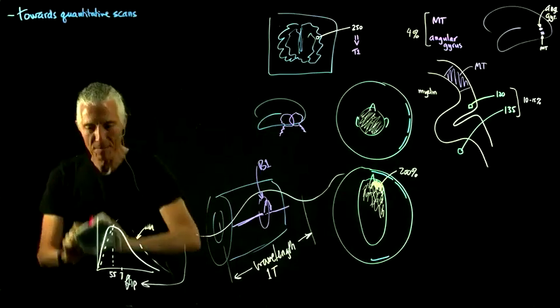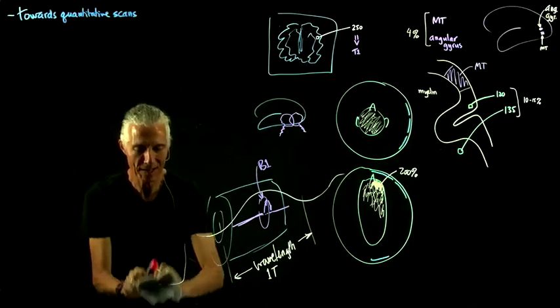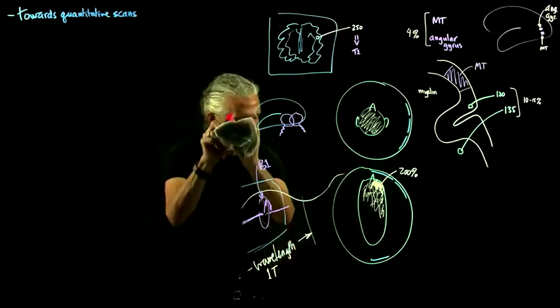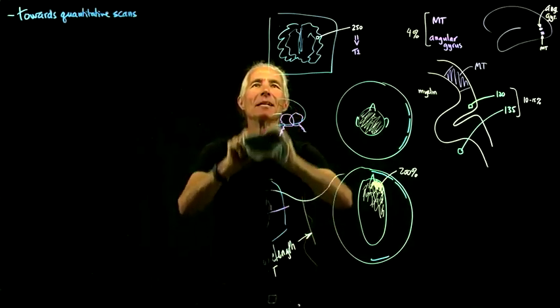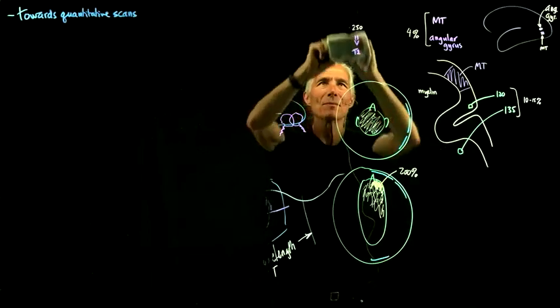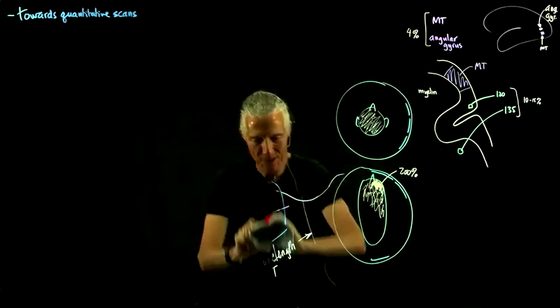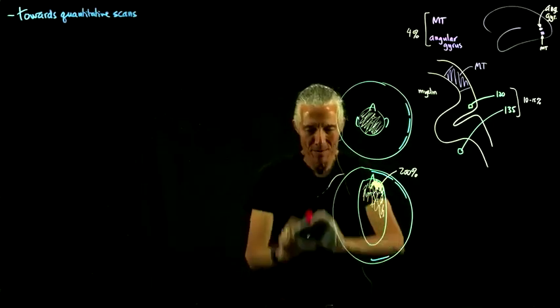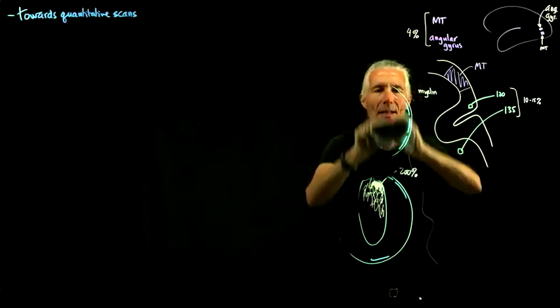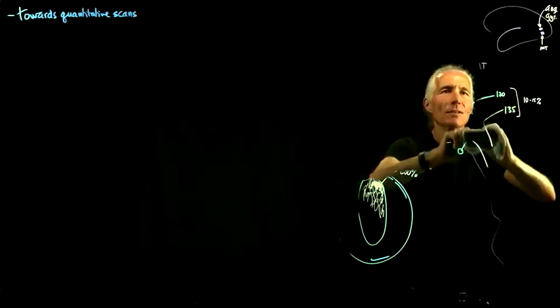And what is the problem with doing this? Well, as you can imagine, the problem is we've got to collect more data. If we just collect one scan, we're just going to have some numbers, and since there are multiple things affecting it, there's no way we can fish those apart, because we've only got one data point. And so all of these things require some kind of additional data collection.